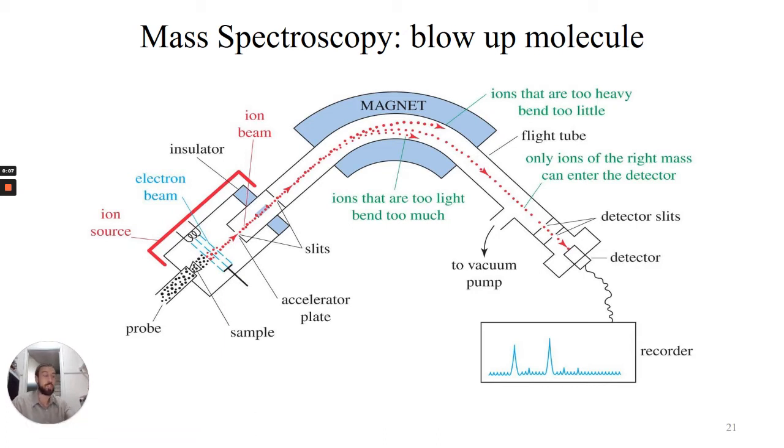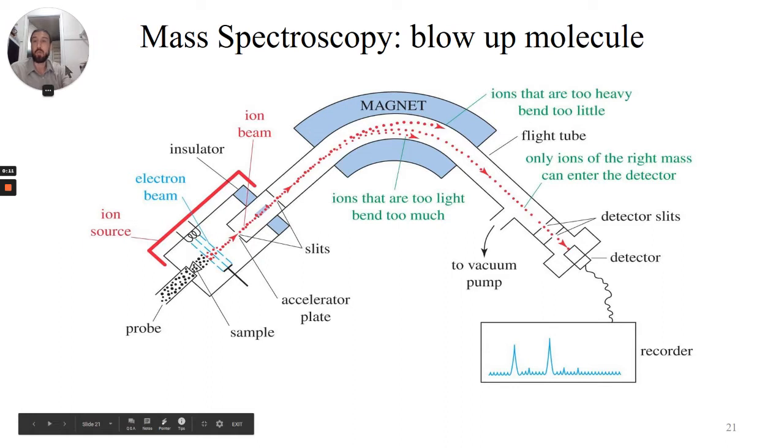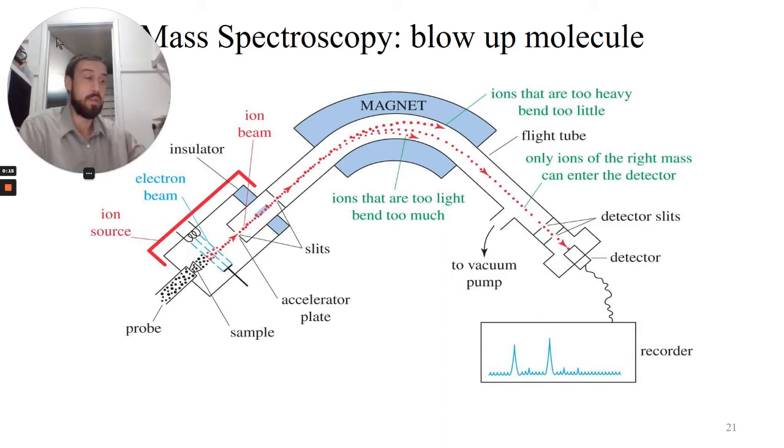So mass spec, what is the point of mass spec? Really what I want you to get out of this is not the nitty-gritty details. Don't stress on that. Just realize that what we're trying to cover is the bare essentials behind what the technique does and how it roughly works. So mass spec is kind of a CSI investigation, if you will.